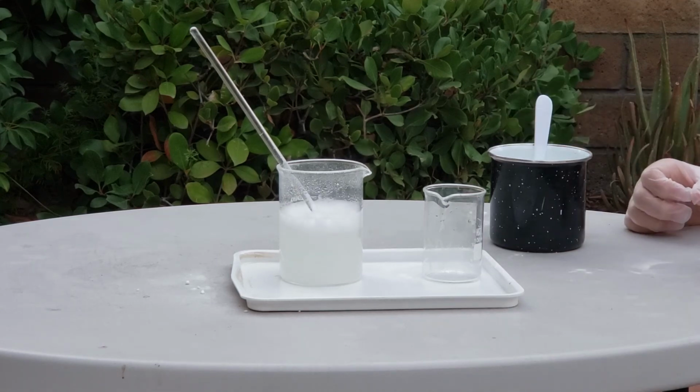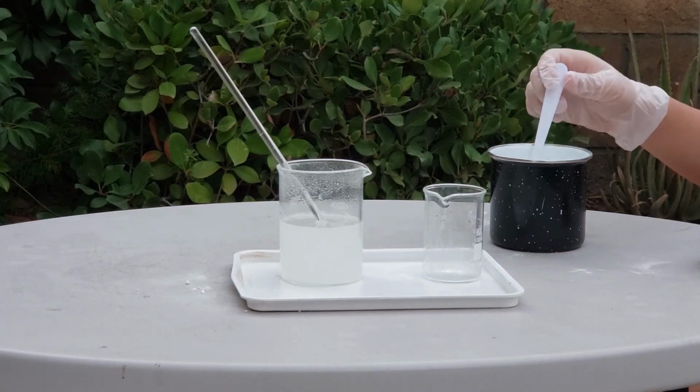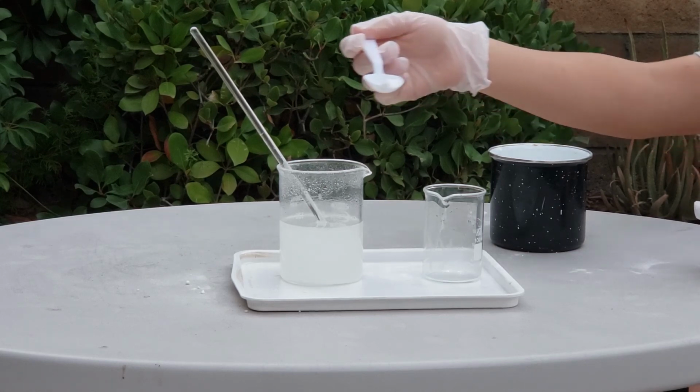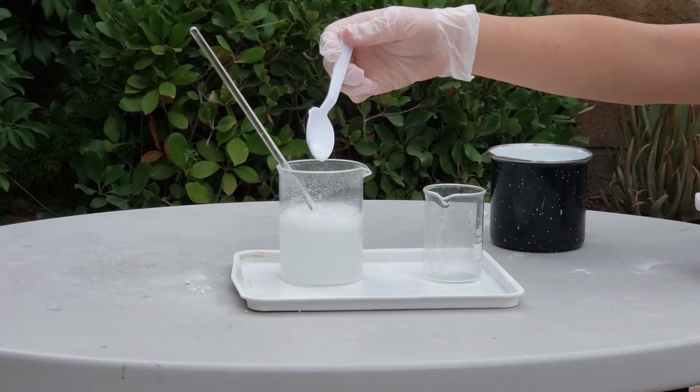And by the way, for the experiment, you'll need 50 milliliters of concentrated hydrochloric acid and 100 milliliters of saturated sodium chloride. My calculations say that for the cleanup, about 48 grams of baking soda will be needed.